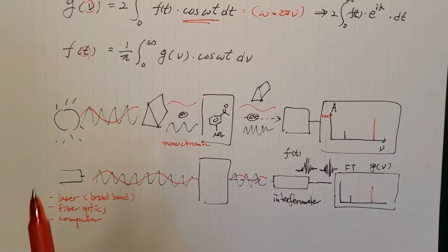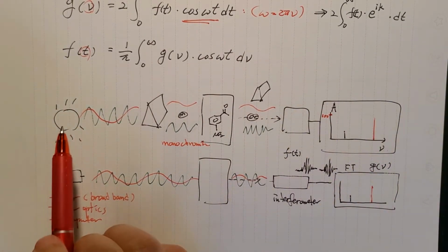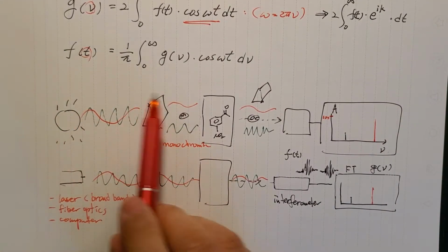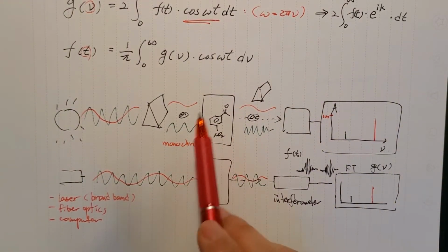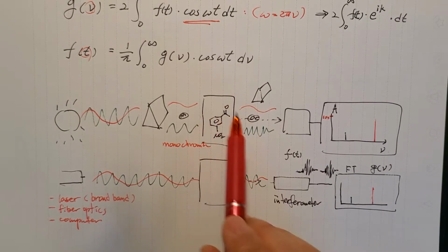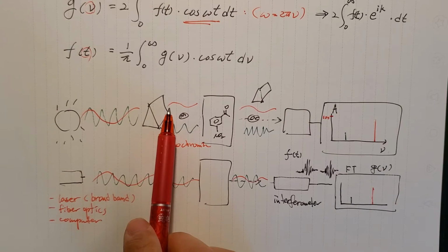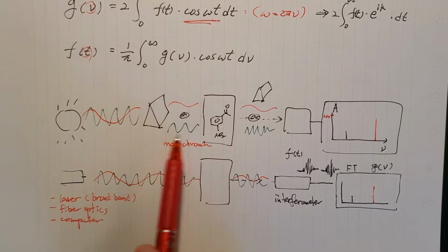So again, the traditional continuous wave light bulb is generating all kinds of wavelengths of light, and that will be selected using a monochromator, and then the light will be interacting with the matter, and the matter, as we discussed, has all kinds of frequencies. When a certain wavelength of light is given at a time, it interacts with the matter.